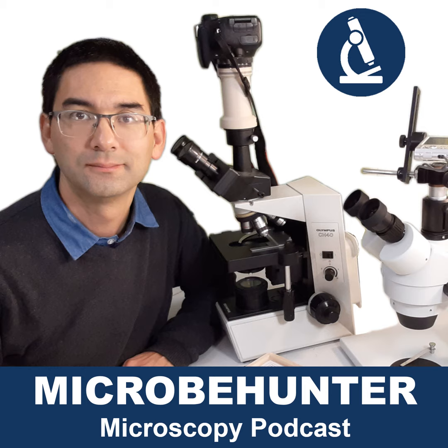Now what sometimes happens is that people use the 100 times oil immersion objective, then they lose focus a little bit, and they want to look at the specimen again using a lower power objective, let's say the 40 times objective. It's still high power actually, but it's of a lower power than the 100 times oil, of course. Then they rotate it back, and they dip the front part of the 40 times objective into the immersion oil, and that's not good. You have to clean it away. Honestly, it's not going to improve the image quality to use those dry objectives with immersion oil. It really doesn't make a lot of sense at all. As a matter of fact, it might even damage the objective. So you should not be doing that.